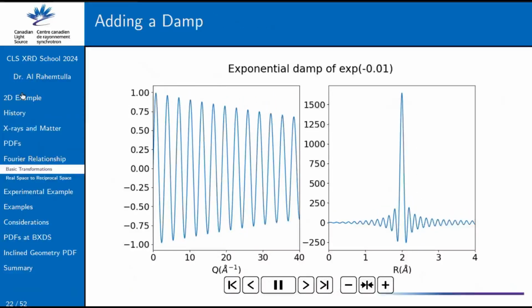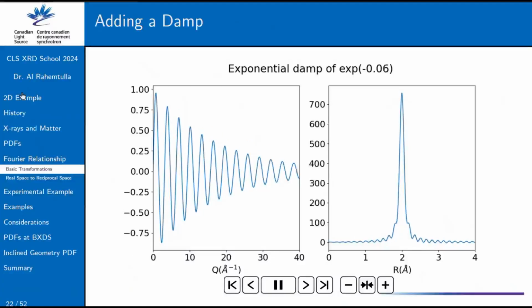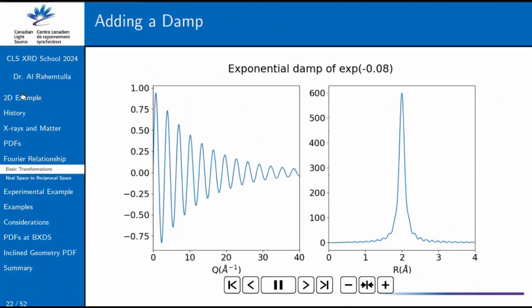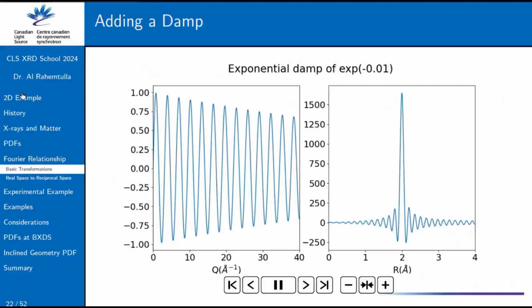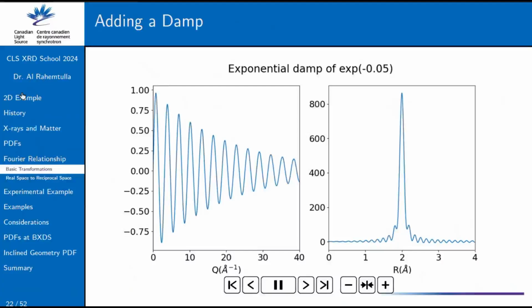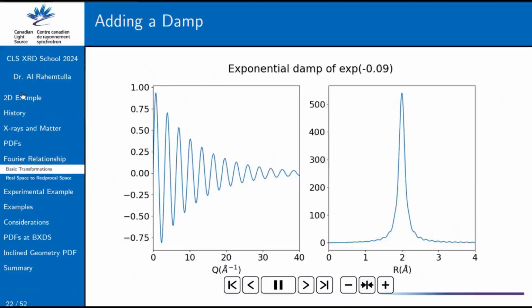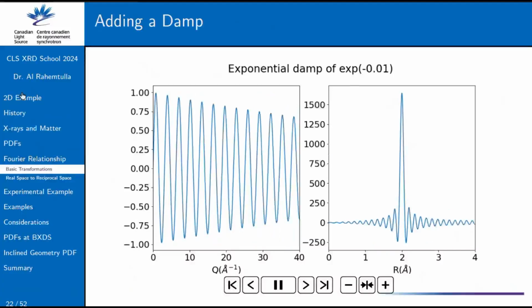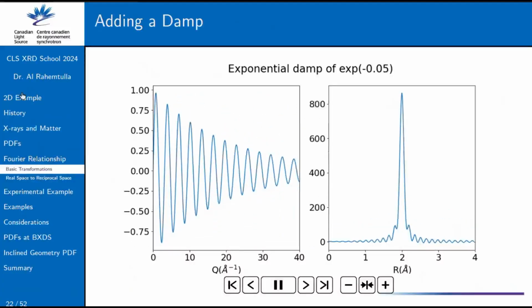And then the other thing is what happens as your signal dies down. So what we see here is, in addition, we see some of those termination ripples starting to go away, but we also see our peak here broadening out as it's decaying out on its own. So usually these things fall off. So one of the things is if you convolute in Fourier transforms a Gaussian into something, you'll get something on the other end. You'll get a Gaussian as well.